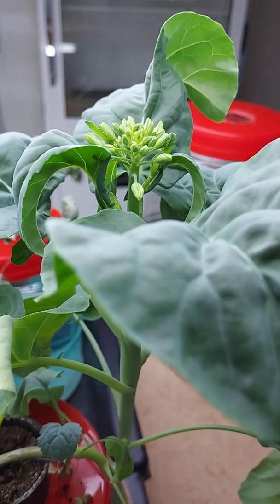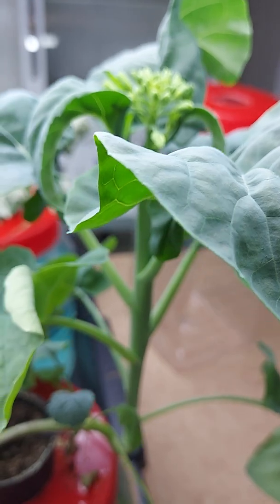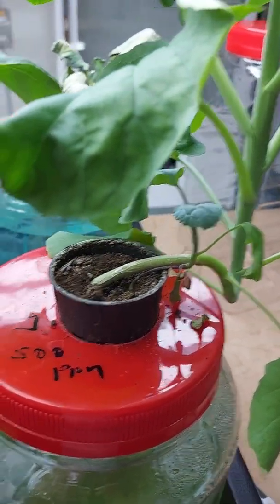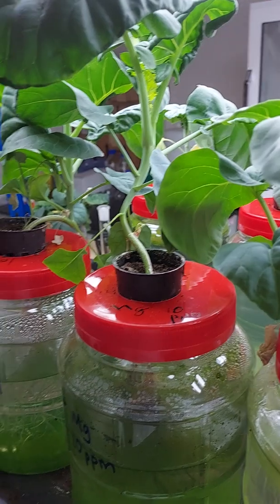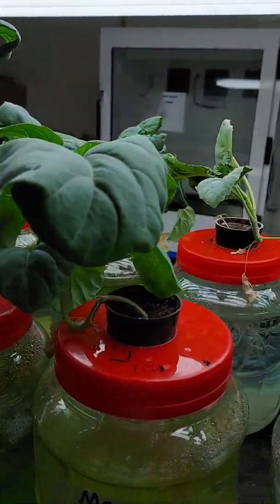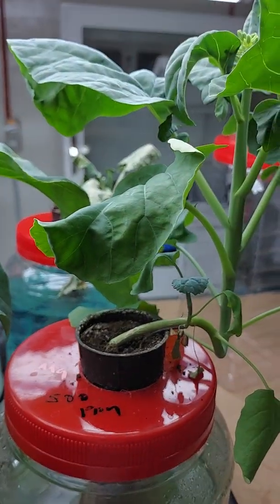You can see the bolting here, which is a phenomenon that's associated with stress. And the plants appear to be fully grown. However, they have bolted and formed flowers. So from this, we can conclude that copper and iron are the most toxic with regard to the environmental exposure. And magnesium appears to be a growth promoter, which enhances growth.